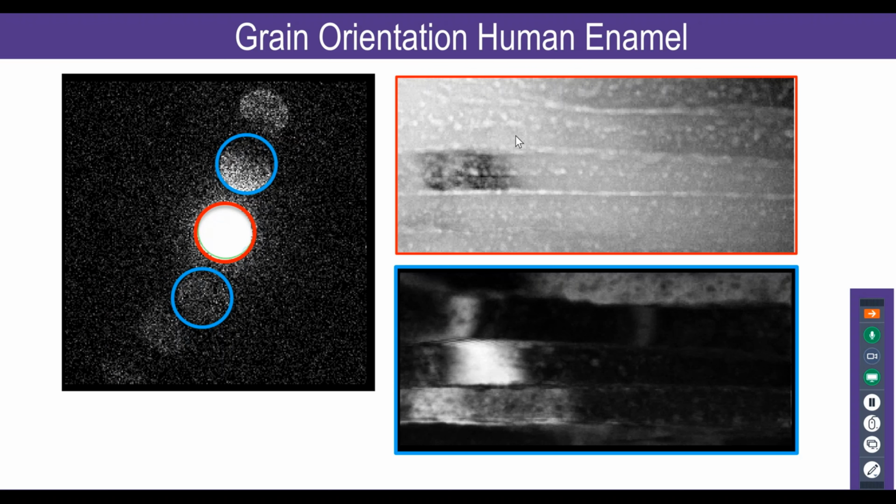So here is another orientation of the same part of the sample. You have those very ribbon-like features, and then you can use the same type of experiment, the same set of diffractions, to measure strain, right? This is a work in progress here, and we're going to hear more about this pretty soon.